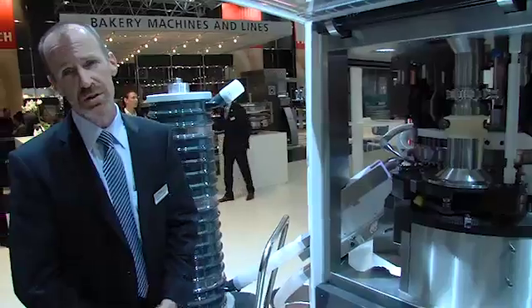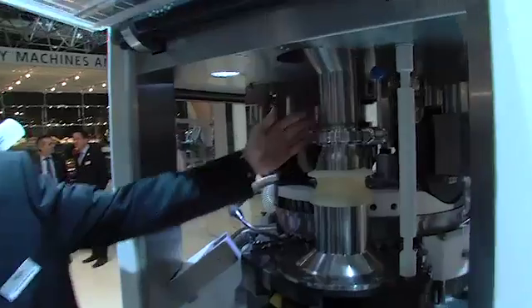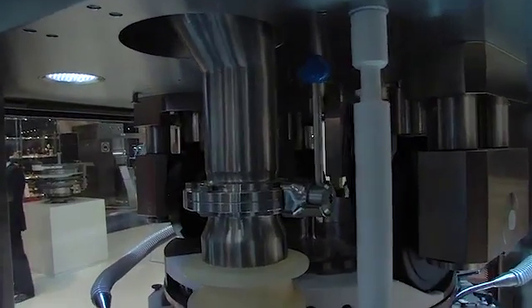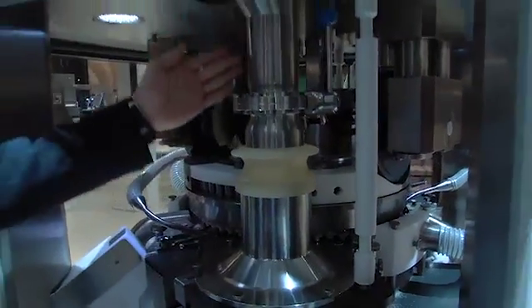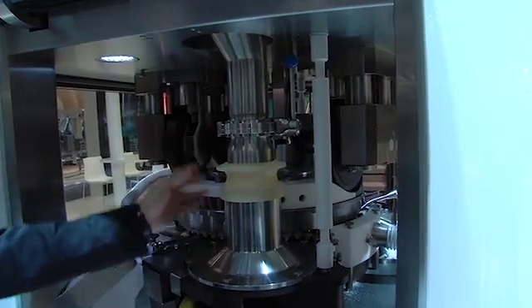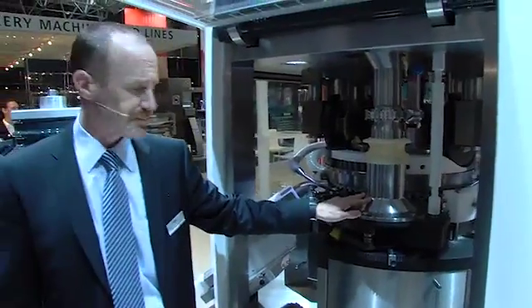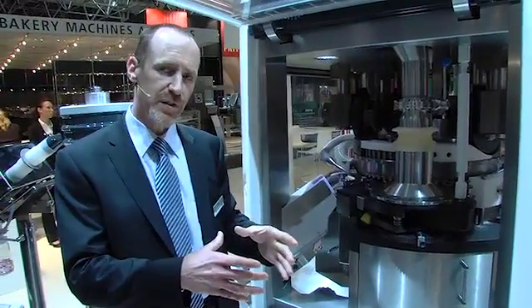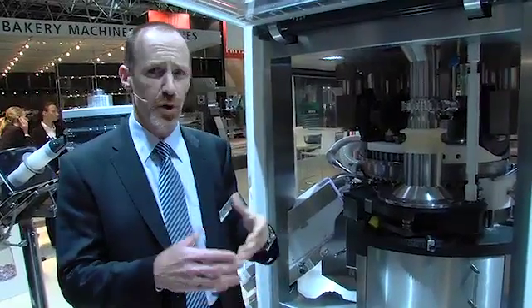The first key innovation that we would like to call attention to is a redesigned Fill-O-Matic feeding assembly. This is a conical Fill-O-Matic, and as you can see, you have a straight gravity feed unobstructed from your in-feed on the press to the conical feeder itself. The conical single paddle design improves pre-filling and improves the overall filling cycle for the feeding assembly, extending to difficult products as well, facilitating compression across the board.